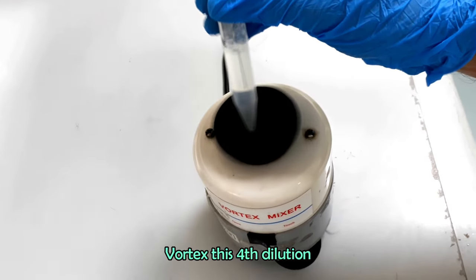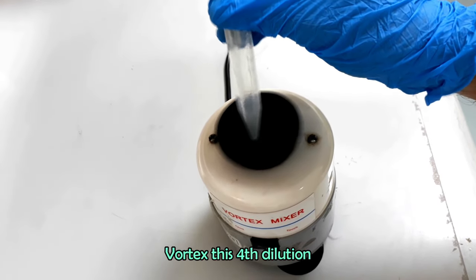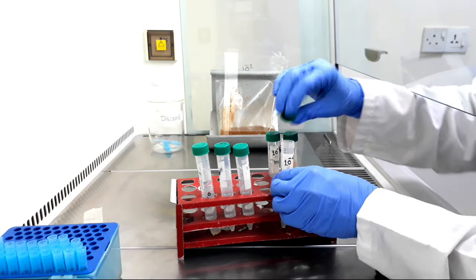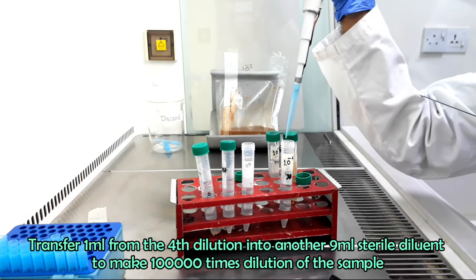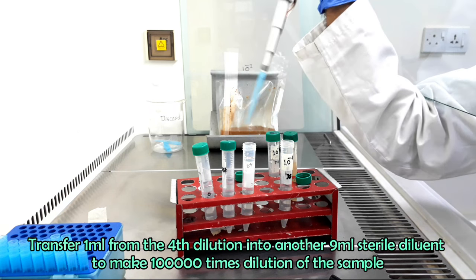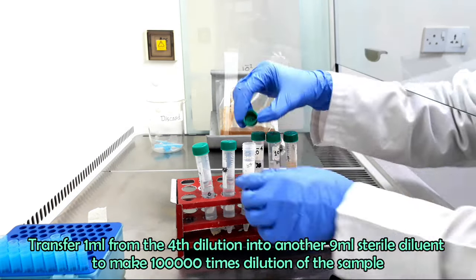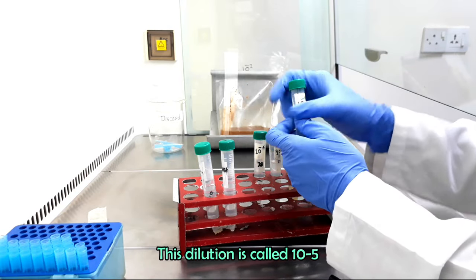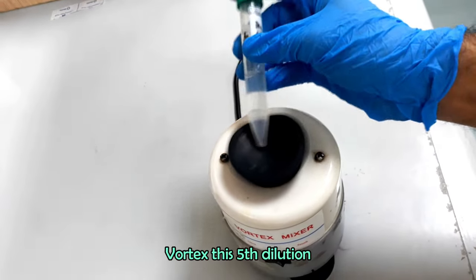Vortex this fourth dilution. Transfer 1 ml of the fourth dilution into another 9 ml sterile diluent to make 1 lakh times dilution of the sample. This dilution is called 10 inverse 5. Vortex this fifth dilution.